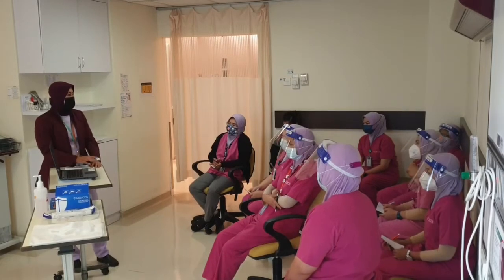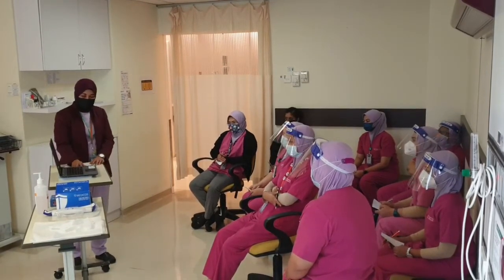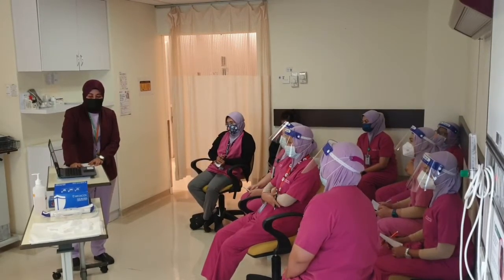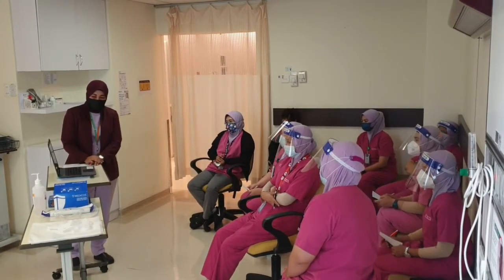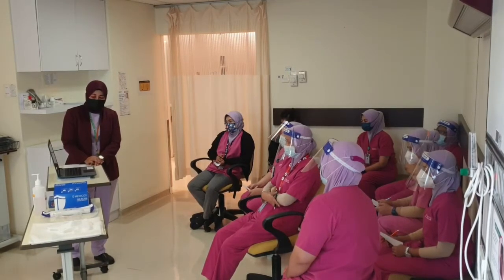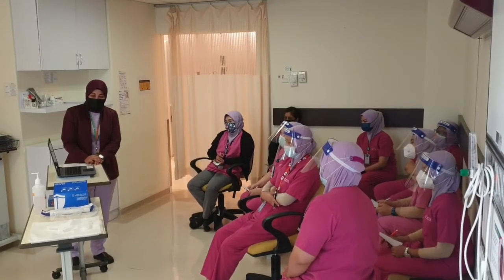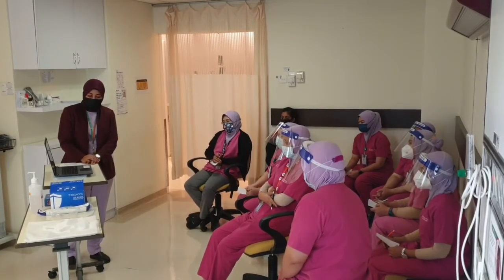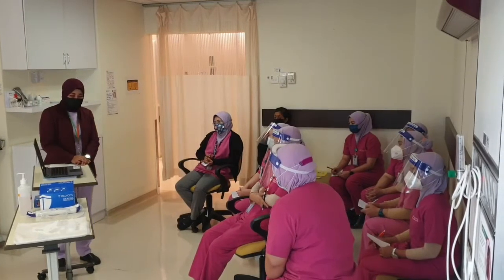This picture shows the full PPE required. So, what is personal protective equipment? PPE refers to protective clothing, helmets, gloves, face shield, goggles, face mask, and/or respirator or other equipment designed to protect the wearer from injury or the spread of infection or illness.